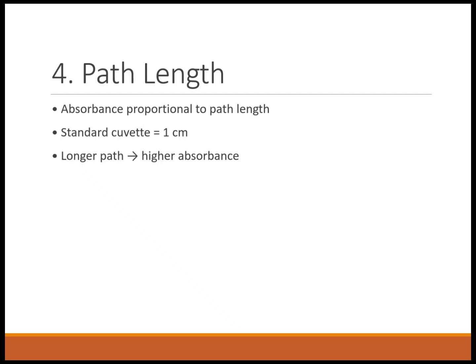So, longer path lengths give stronger absorption. So, the length of the cuvette will affect the absorption. So, it is a major factor.